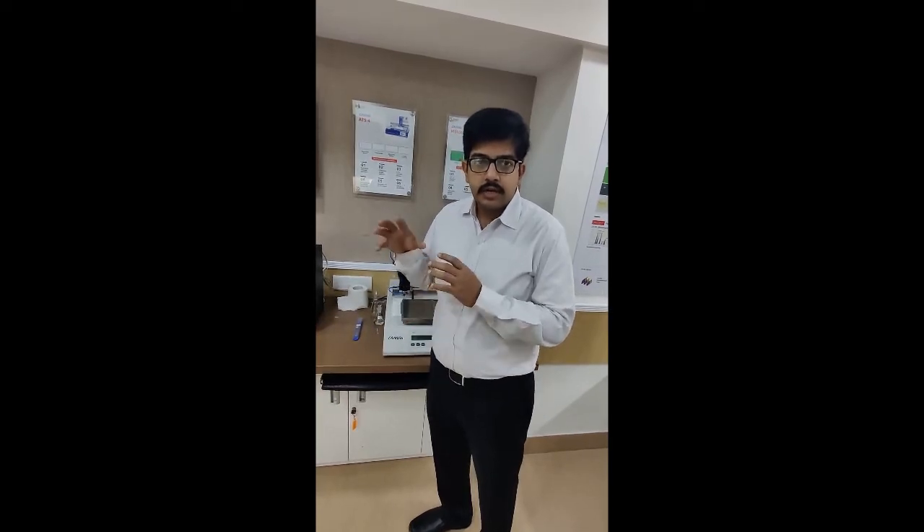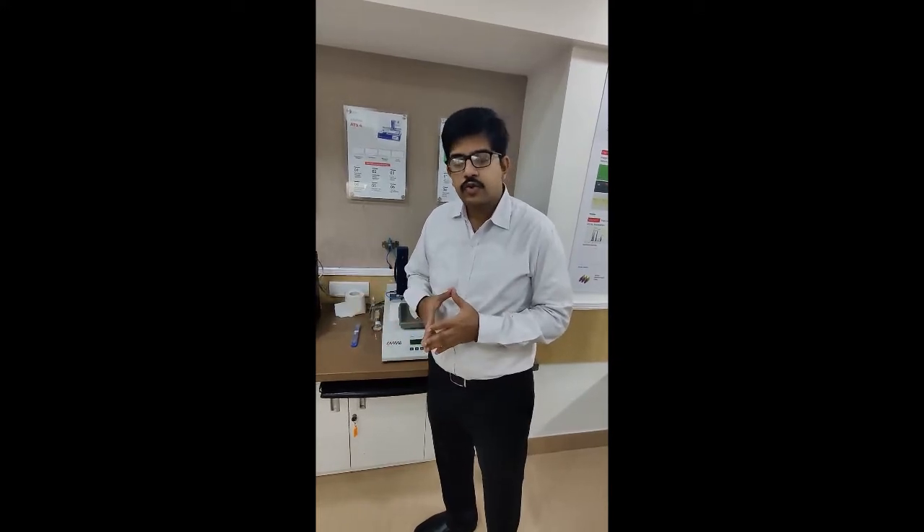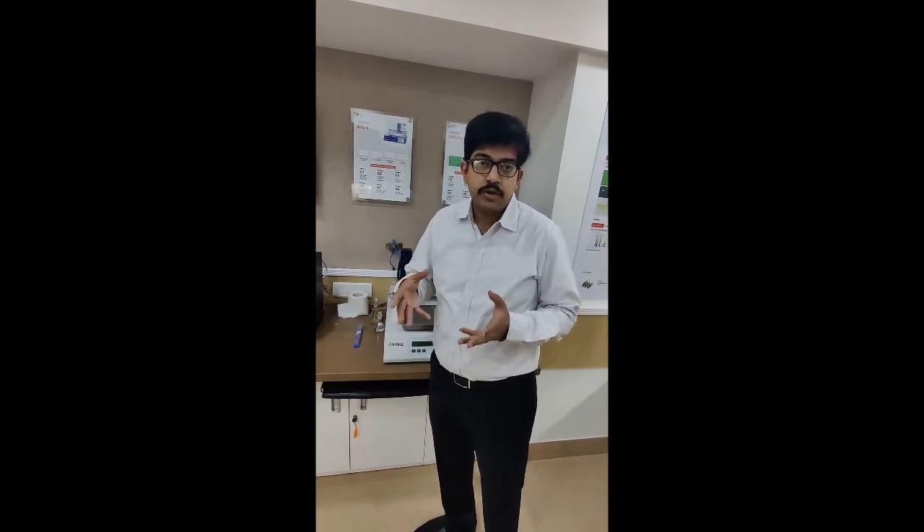The first question is: I'm not getting proper bands on my plate. There are two possible reasons. The first is the application speed. Please verify the application speed using the application speed control in the VisionCats or WinCats software. It is normally denoted by nanoliters per second. You can define a high application speed for a volatile substance such as acetone, and a slower application speed for samples made in water. Ensure that you are using the right application speed.